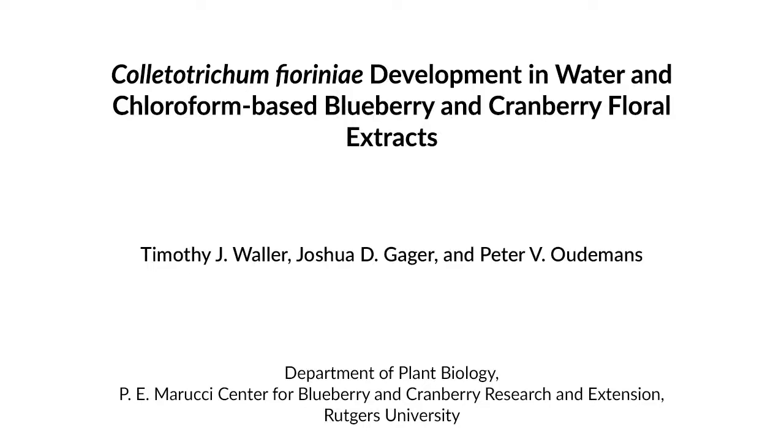This protocol provides an inexpensive and adaptable system to evaluate the temporal dynamics of floral chemical cues on Colletotrichum fioriniae and other plant pathogens that infect during bloom. Novel floral rainwater collection devices enable the user to monitor natural stimulants and conditions affecting pathogen development in a near real-time, site-specific manner.